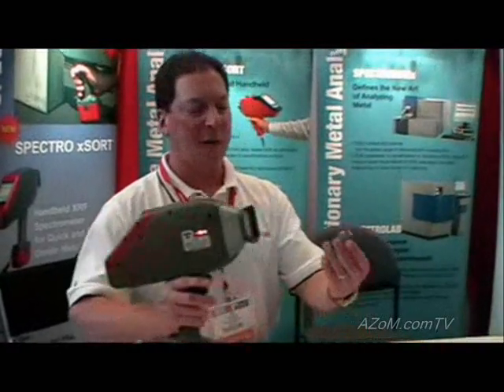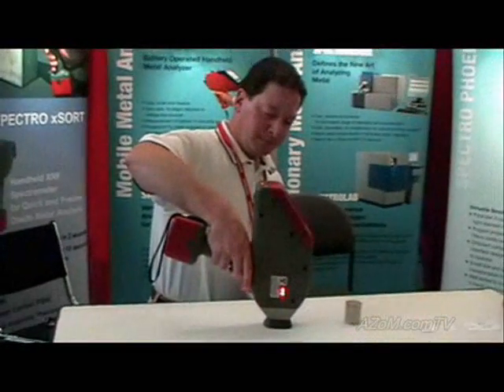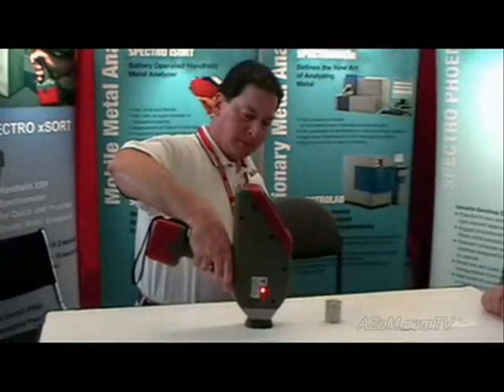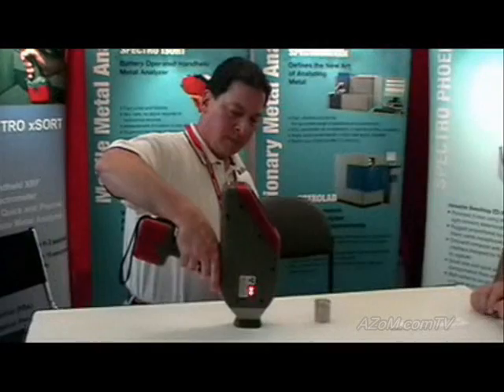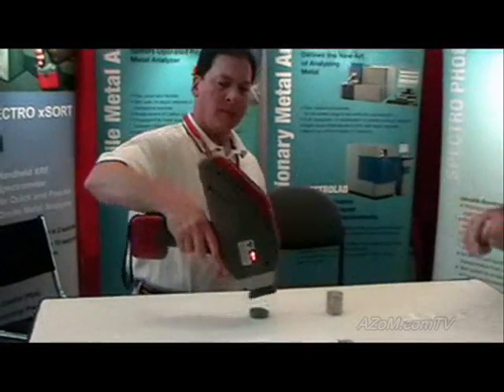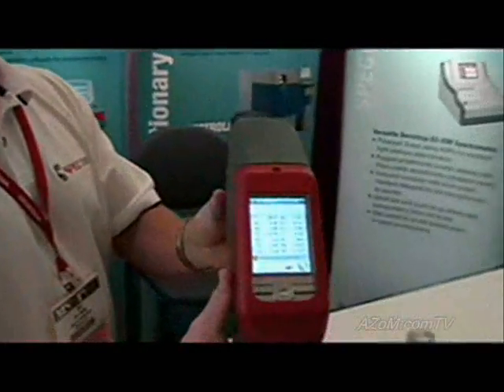I'll run another sample right here. This is a titanium sample. The aluminum content in the titanium sample is important — it's a 6-4, and you're looking for 6% aluminum. And in 10 seconds, without cleaning the surface or without vacuum, we're able to get the aluminum reading.